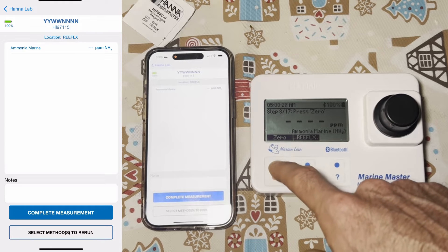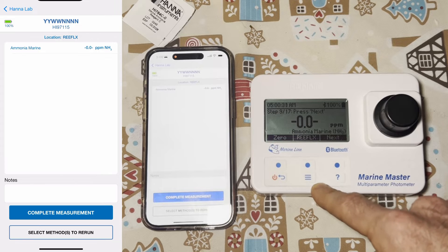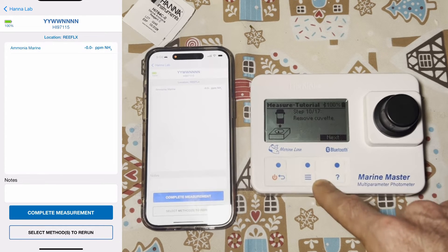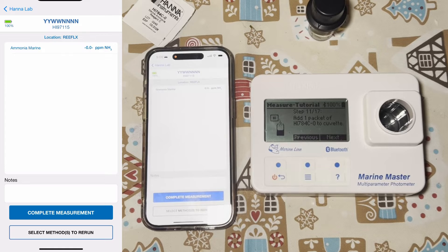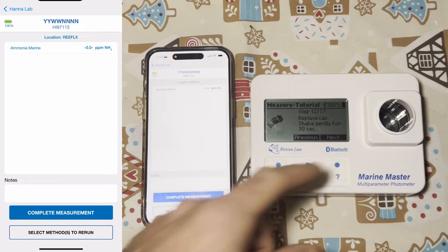We are ready to zero it out — I'll say zero. We're ready for the next step. Remove the cuvette. Now it wants me to add in one packet of HI784C, and that has been added.